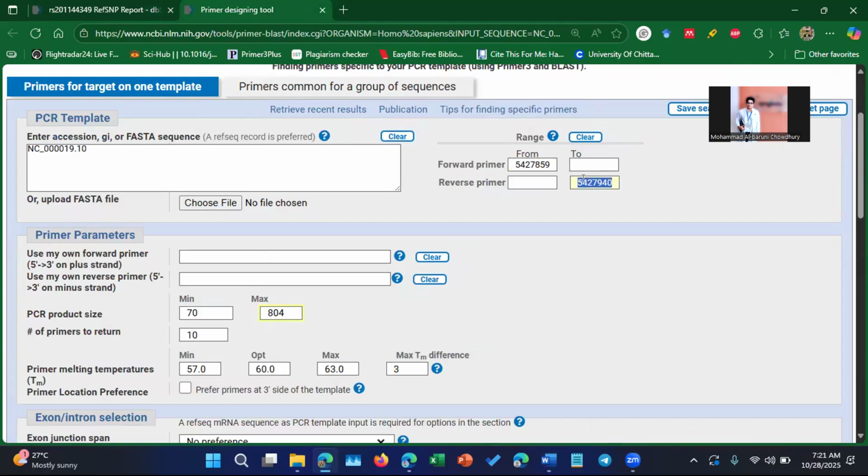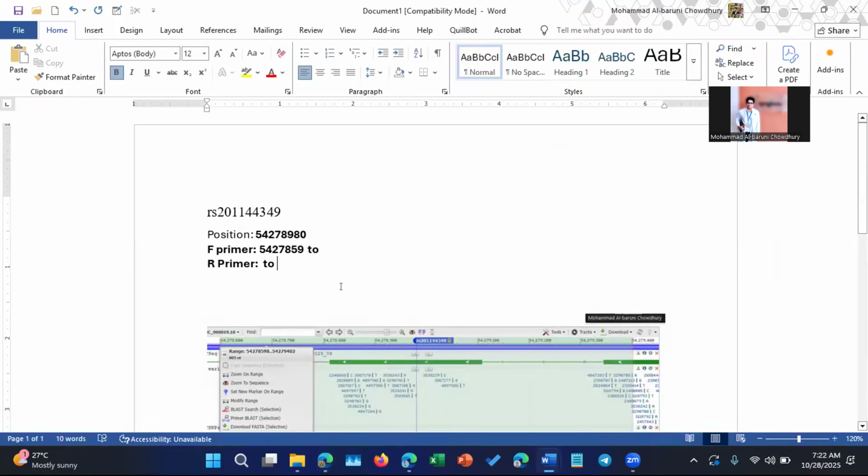This is the last region. As you see, there are many digits, most of them not seen here. The last digit is invisible here. So when selecting, you have to make sure all of the digits can be copied, or you can just double click. It will select the whole thing, or Control A will also work. Then just paste it here in the region.